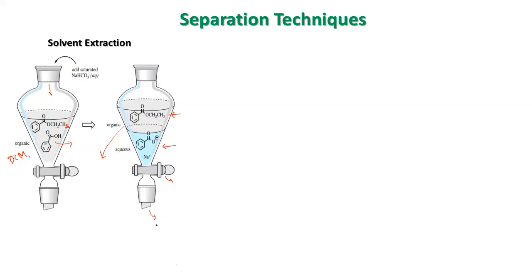So you have collected the water part, right? This is your water part where you have the sodium benzoate dissolved in the water. Okay, so now my question is how do you get back the benzoic acid, because you have the sodium benzoate. So you need to get back the benzoic acid. What is the technique you will use? Who can tell? You have to use your brain quickly.